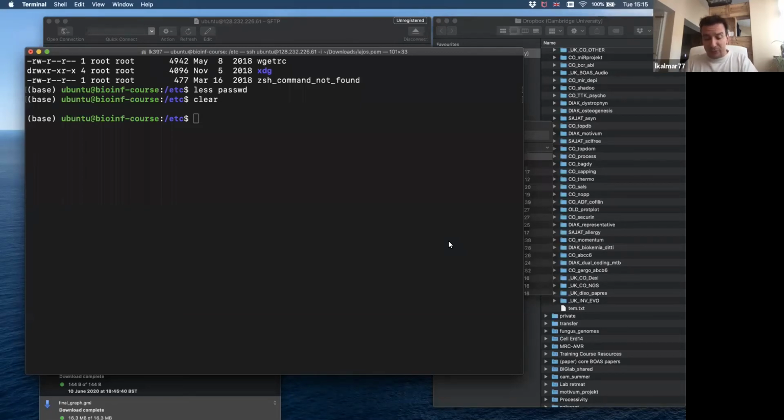The genetic distance tree, if you go for an alignment-based one, because you are pretty sure that there will be genetic regions that are ready to align, then, okay, let's go from the most similar ones to the less similar ones.